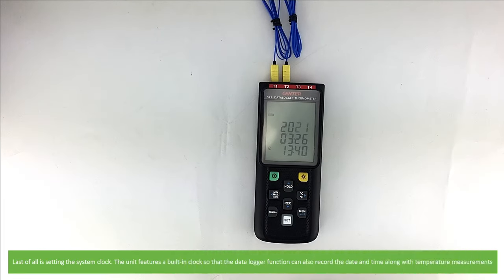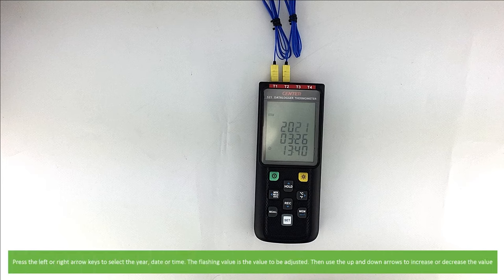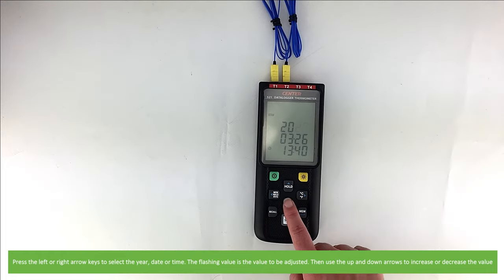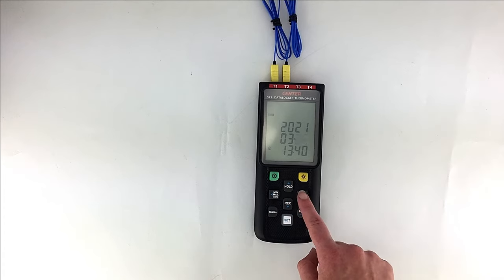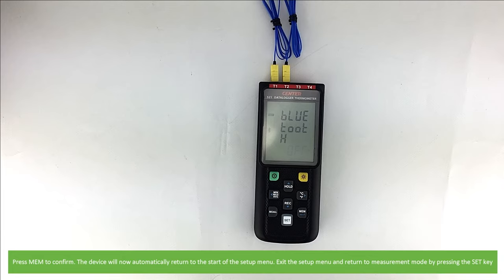Last of all is setting the system clock. The unit features a built-in clock so the data logger function can also record the date and time along with temperature measurements. Press the left or right arrow keys to select the year, date, or time — the flashing value is the value to be adjusted. Then use the up and down arrows to increase or decrease the value. Press memory to confirm. The device will now automatically return to the start of the setup menu. Exit the setup menu and return to measurement mode by pressing the set key.